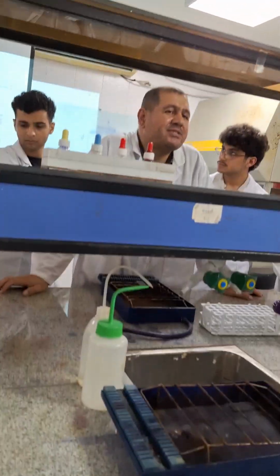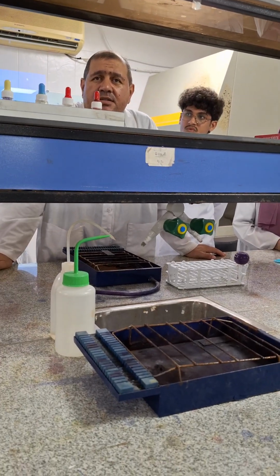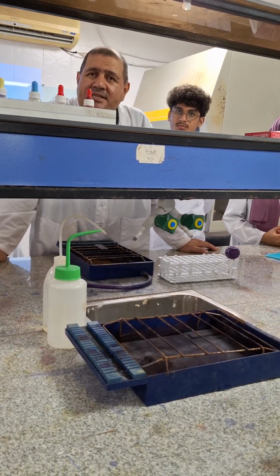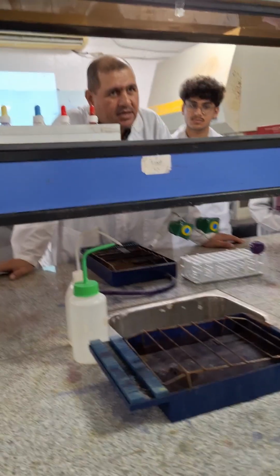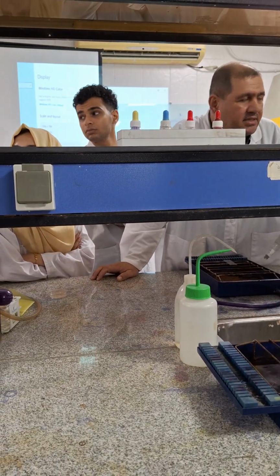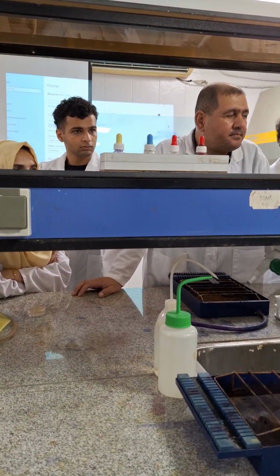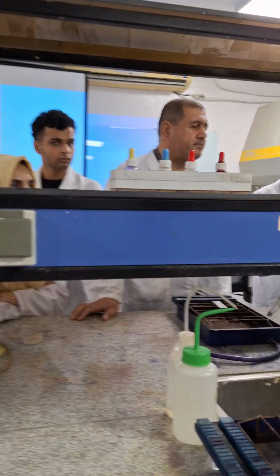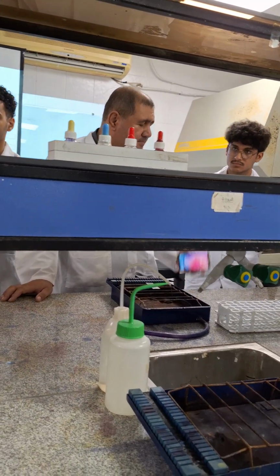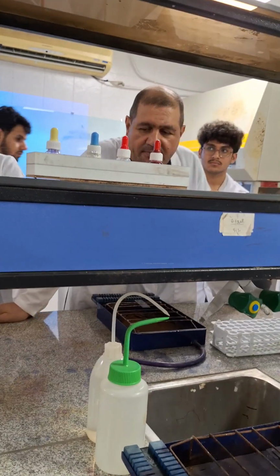To observe bacteria, we use staining. There are two basic types of staining here: simple staining and differential staining.